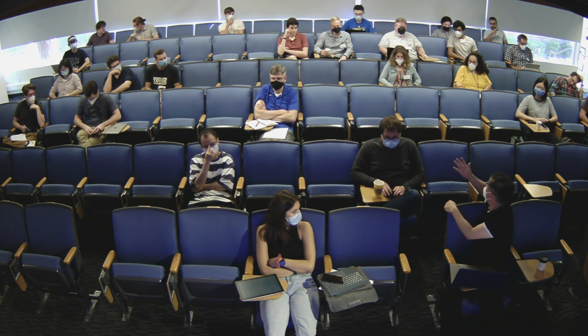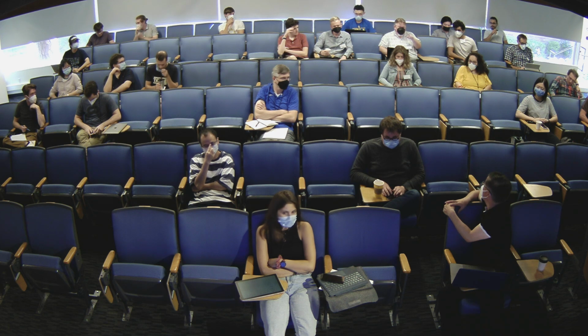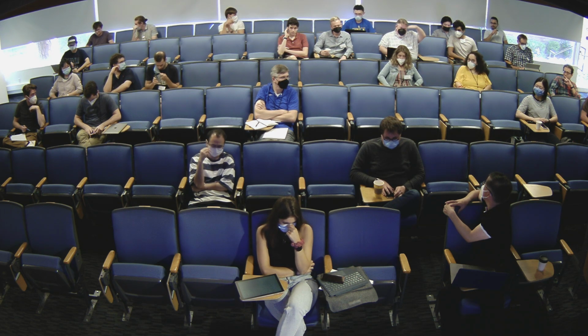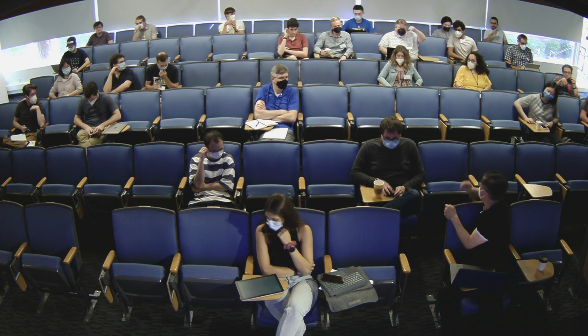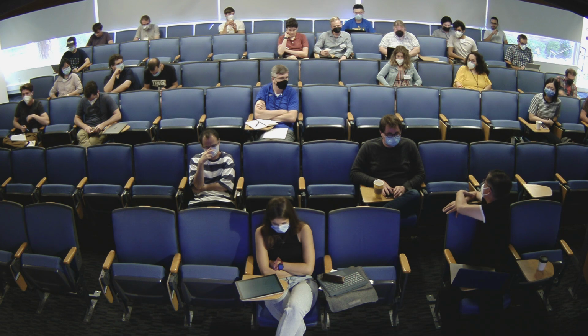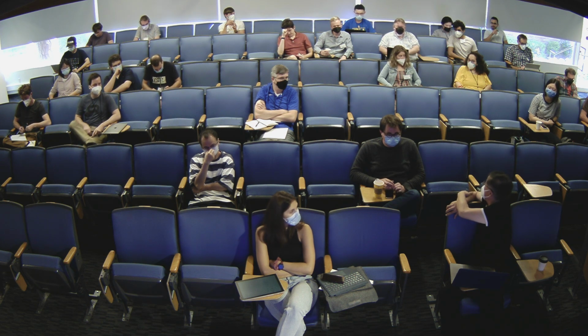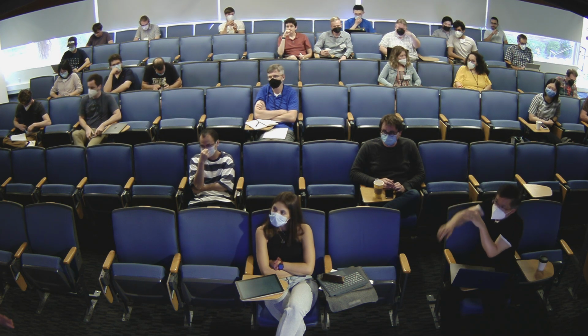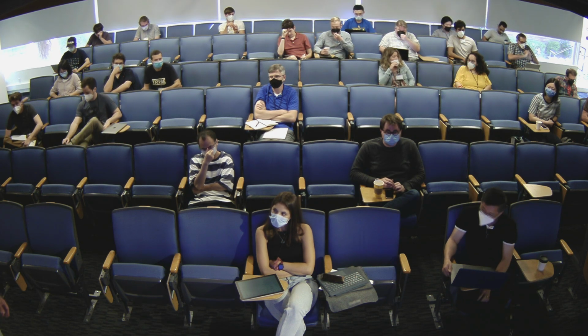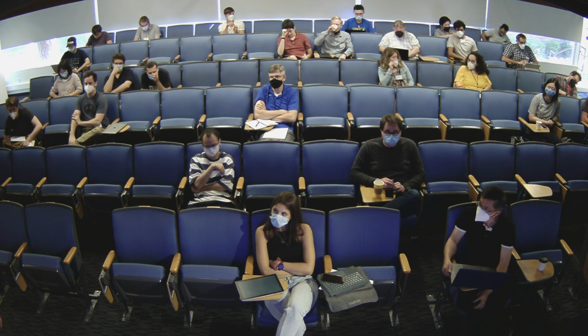But I think the approach is similar to the Van Dyke and Chen phasing. Yeah, but that's a special case. This is not very general, just the same as enclosed symmetry. You have to put in a lot of conditions, constraints, in order to invert it successfully. I'm not sure how that should be done.